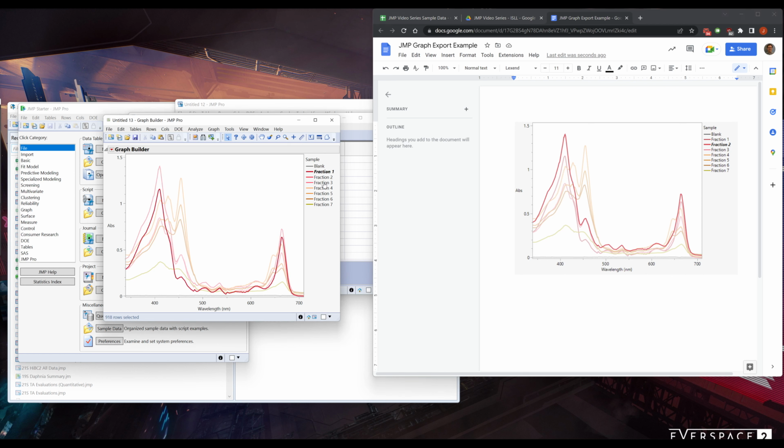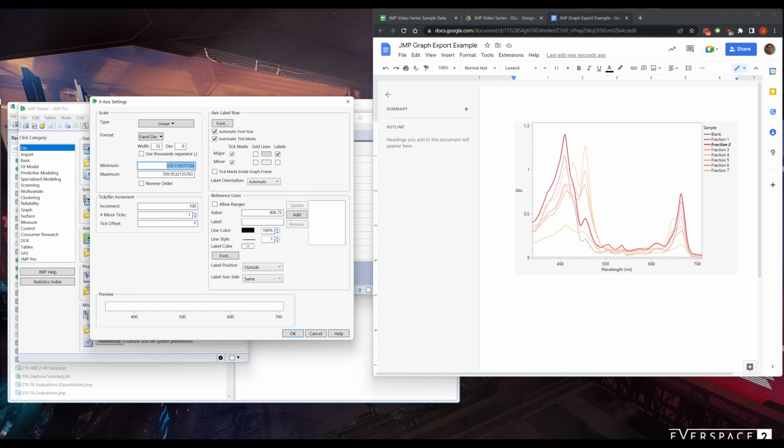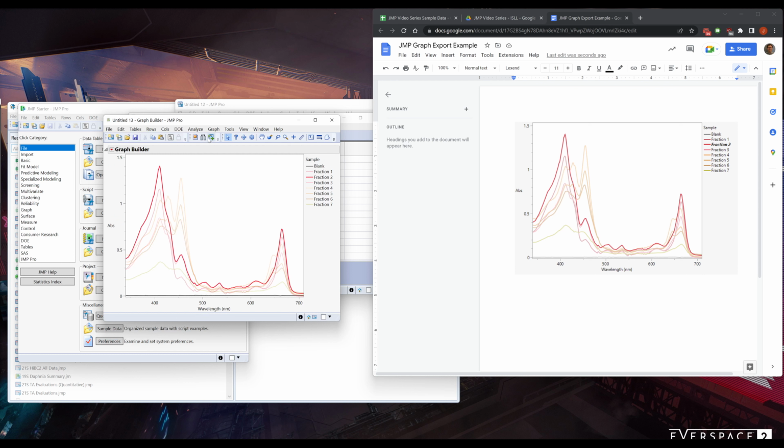In this case, I guess I would have to go through and change the transparency on all of these to, let's say, 0.2. So now we're looking at, say, fraction 2 here. We have a couple peaks. I want to highlight these three main peaks here. The way I'm going to do that is a little bit of guess and check. Ideally, I would actually go into the data and look at the maximum here. Why don't we do that actually?